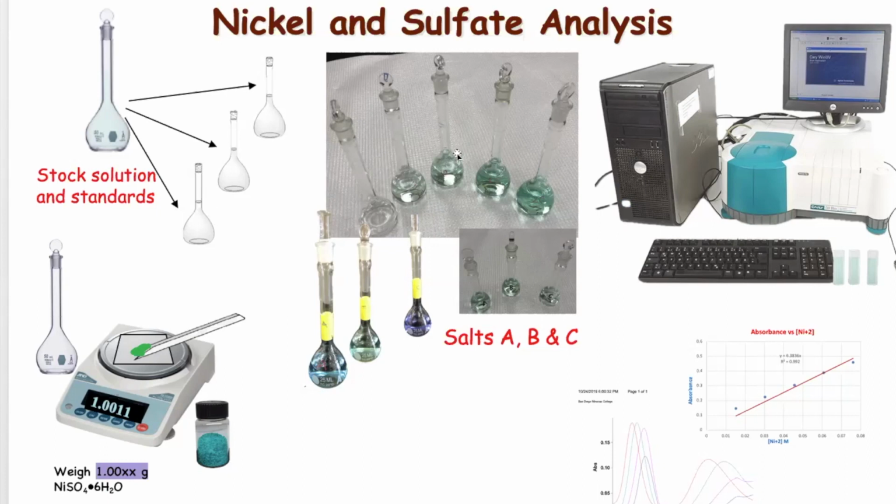And this is what it looks like, okay? If you were in lab, you would make a total of 3. Since I did this experiment, I made a total of 5, okay? Don't worry, you guys don't have to do the procedure. You just need to be able to analyze the results. So these are the data points for the 5 solutions, it should be a linear graph. Okay, that's just for the nickel. This calibration curve right here is for the nickel +2.